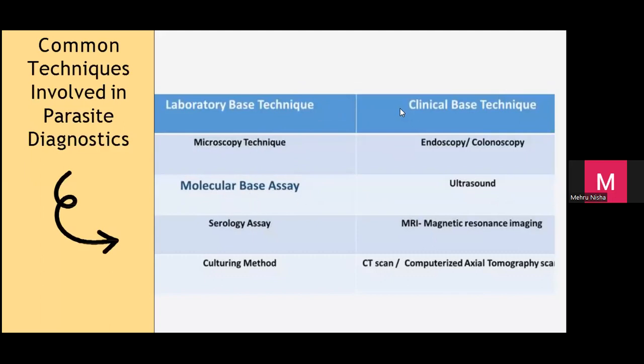Anyone have done PCR? Ada sesiapa sini buat PCR? Tapi dah belajar lah. So we'll look into this today. Serology. Serology assay. Sekarang masa zaman COVID ni, dia macam dah jadi very familiar lah.